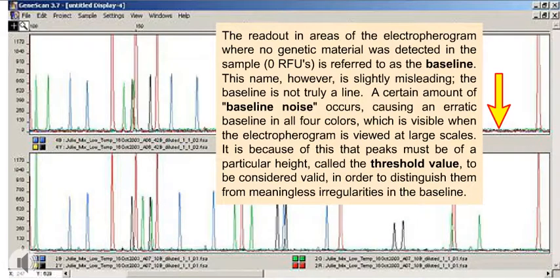The readout in areas of the electropherogram where no genetic material was detected in the sample, zero RFUs, is referred to as the baseline. This name, however, is slightly misleading. The baseline is not truly a line.